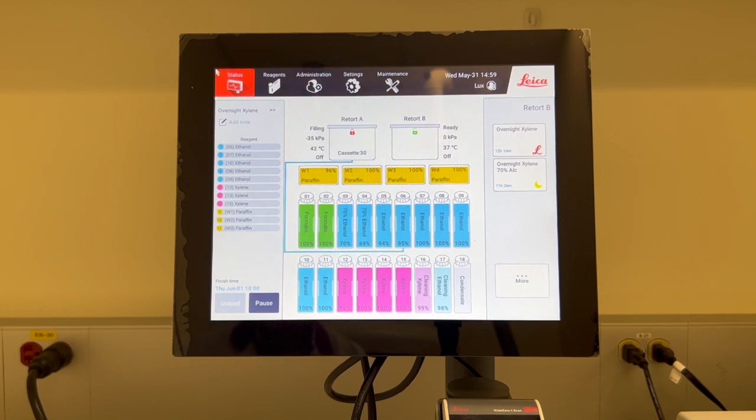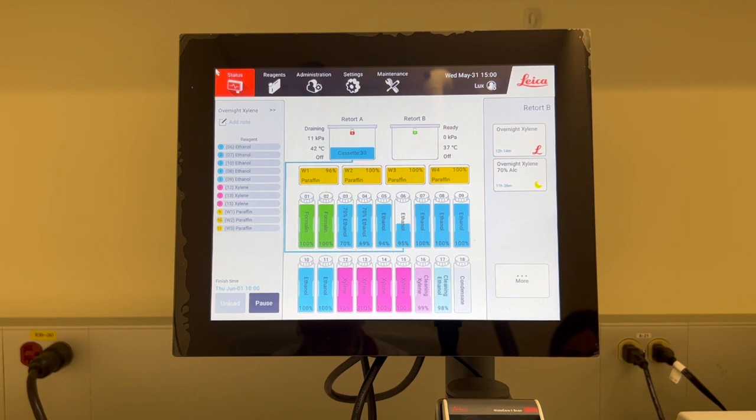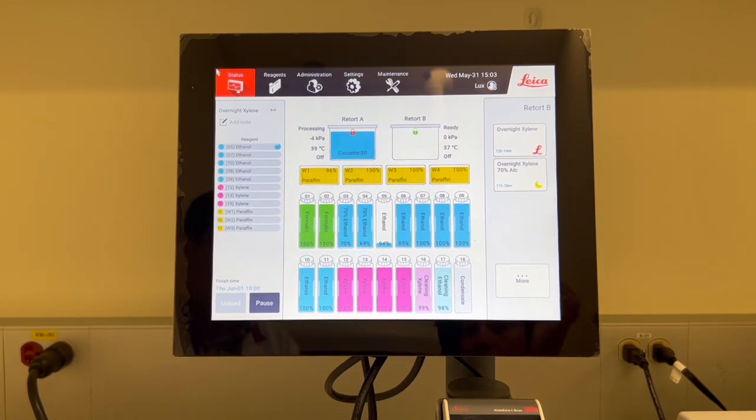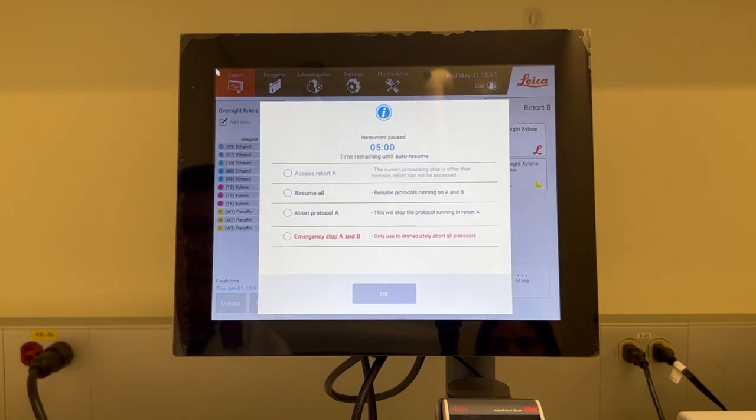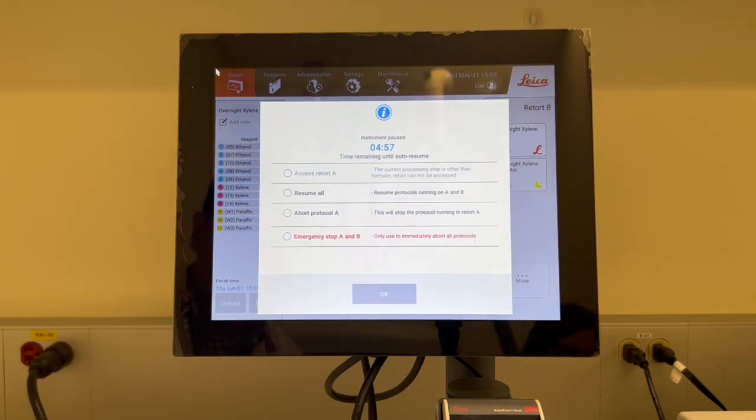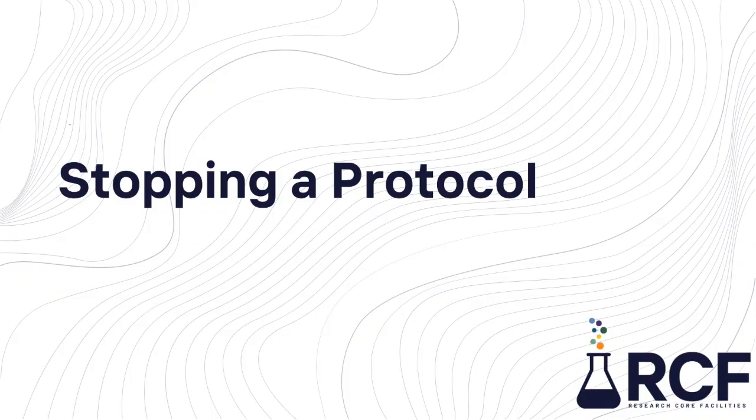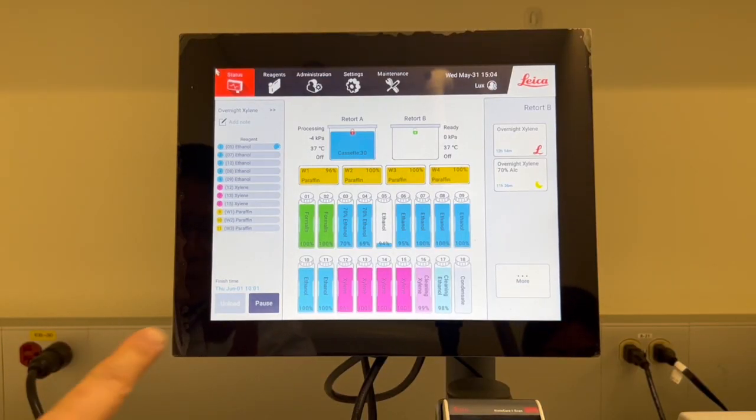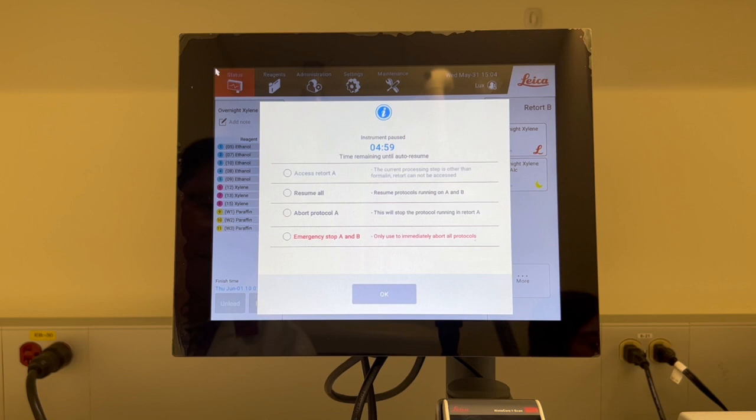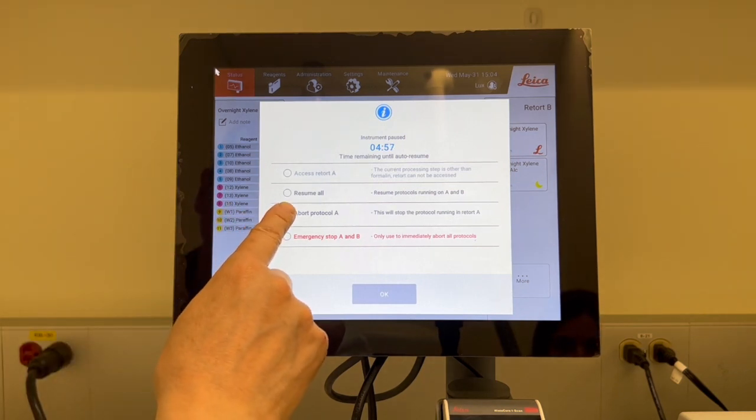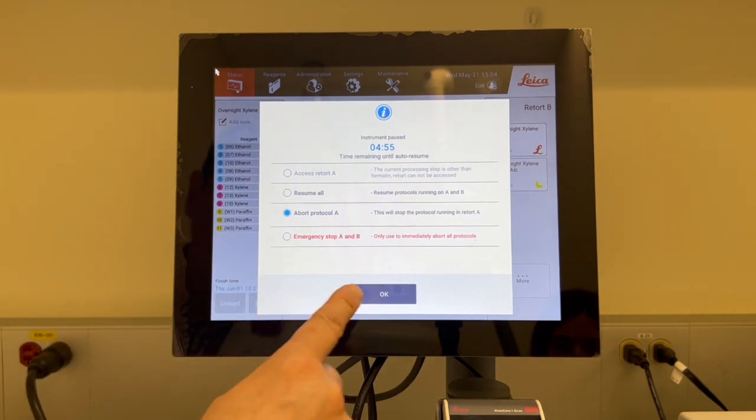Now you can view the progress of your run on the status screen. You can also pause the protocol run to add additional cassettes or to abort the run completely. To stop a protocol that has started, tap the pause button on the status screen. The protocol in the retort you tap will stop running and the instrument pause dialog will open with a number of options. Please follow the instructions on the screen.